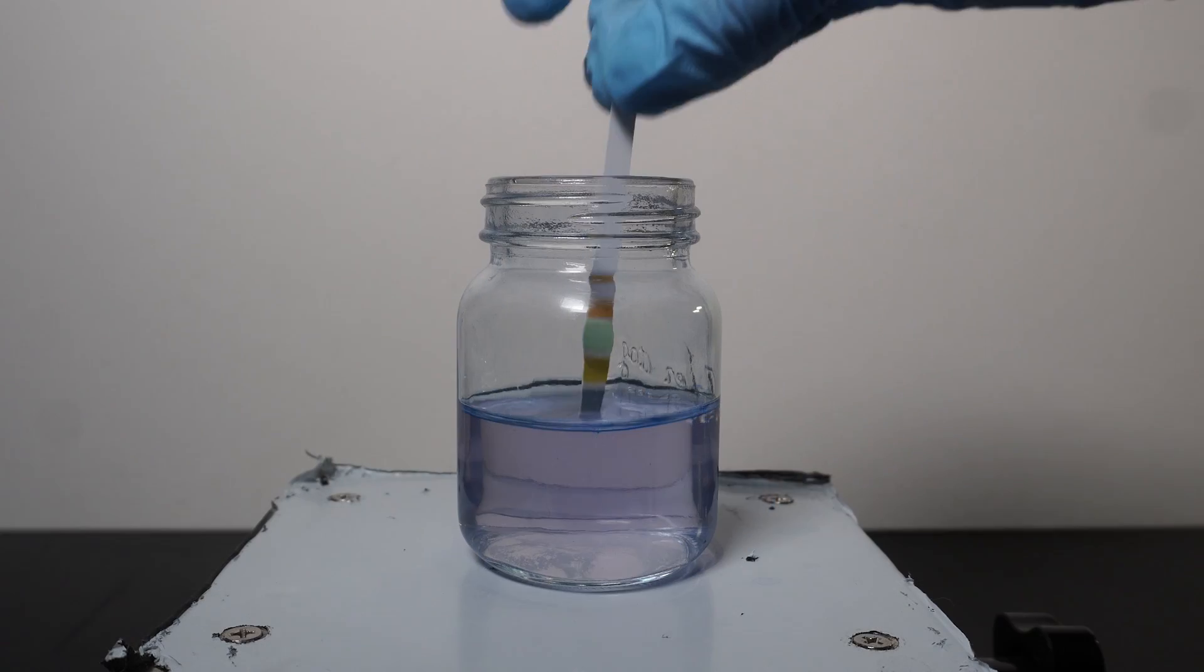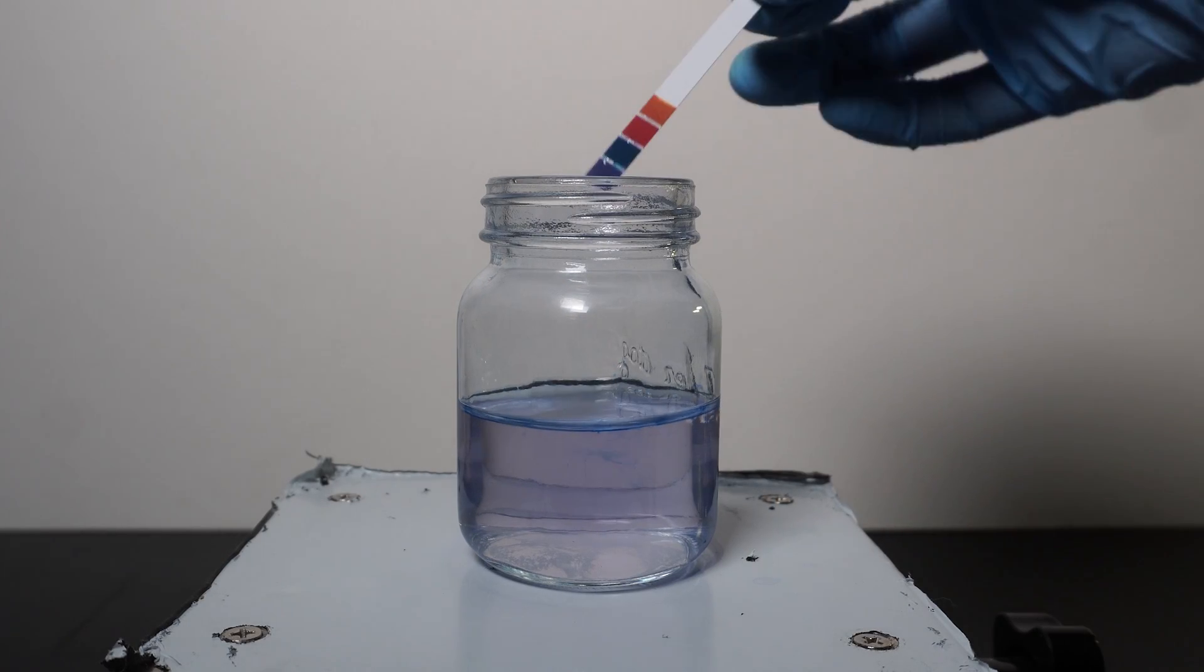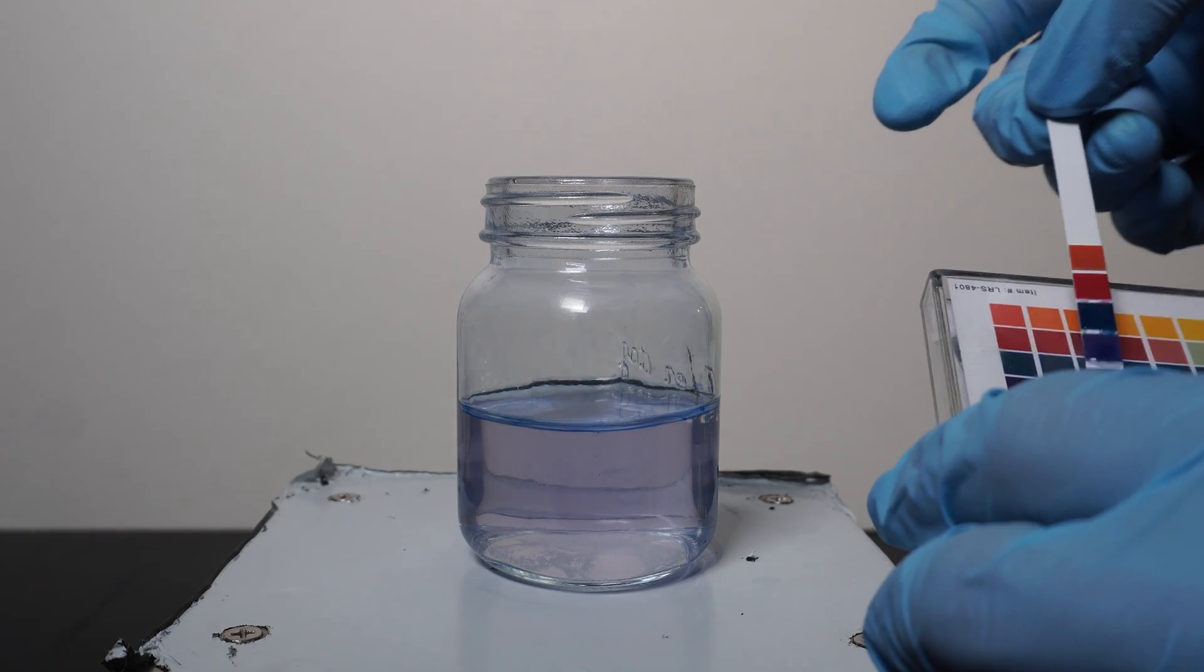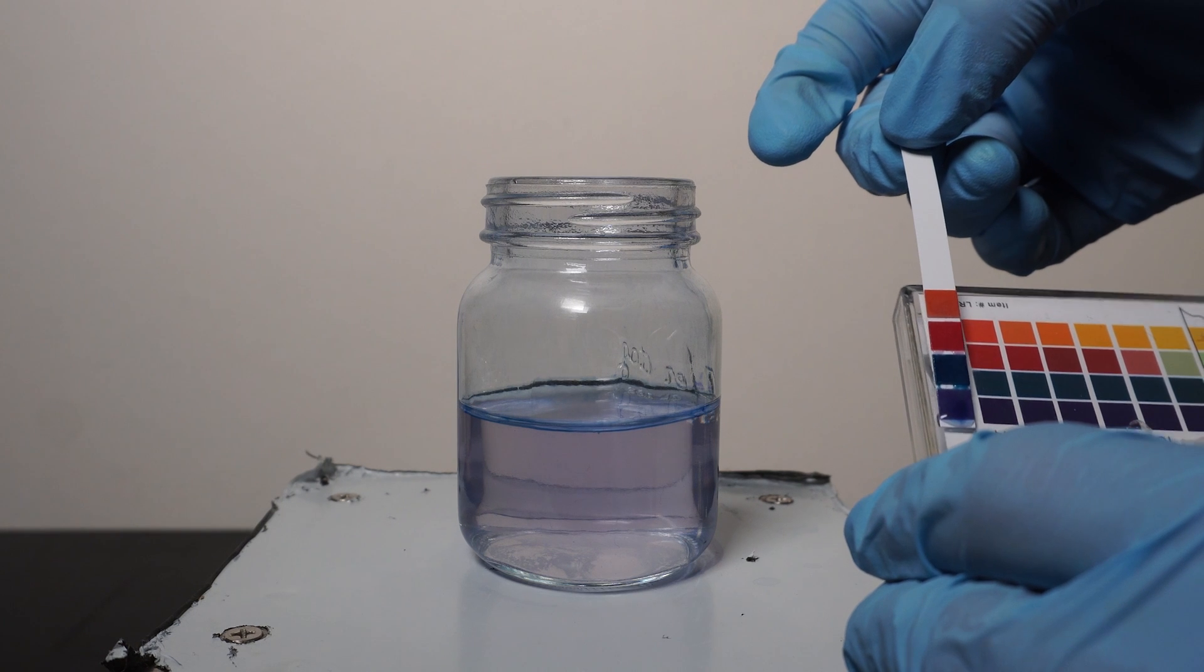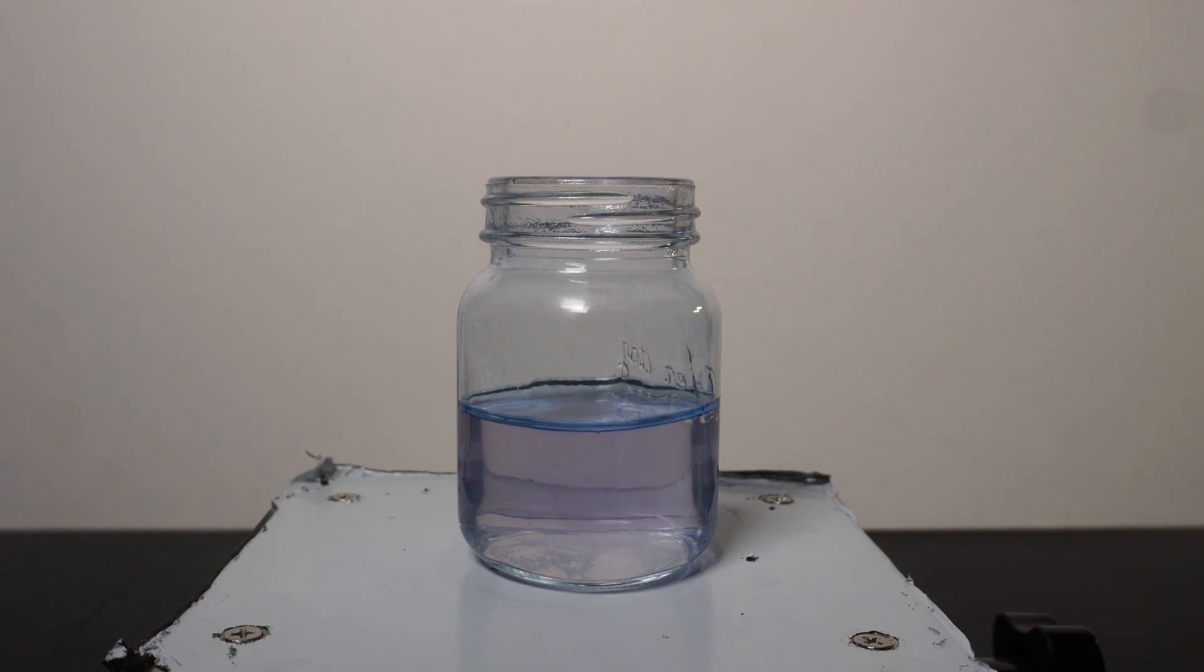After about 10 times, the solution will start to take longer and longer to reduce the methylene blue back to colorless. From here, I check the pH of our now used solution, and it comes out extremely basic, with a pH of around 13 or 14.